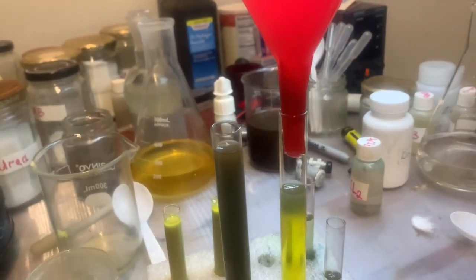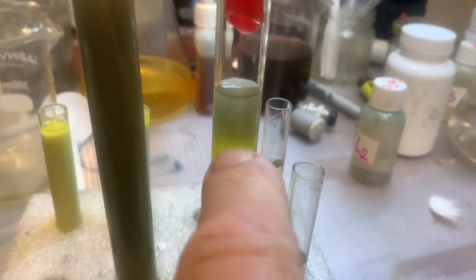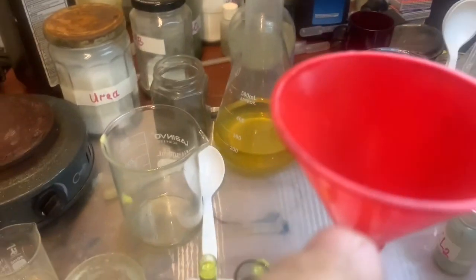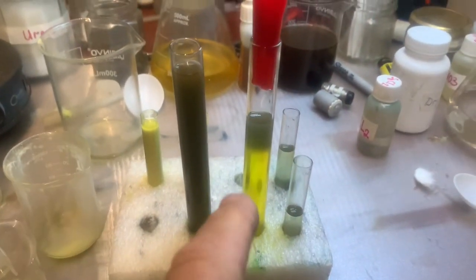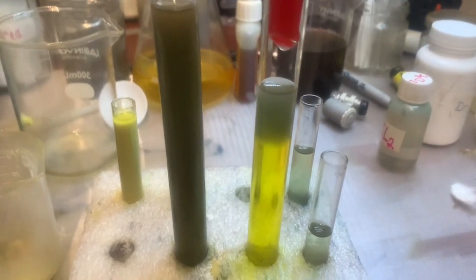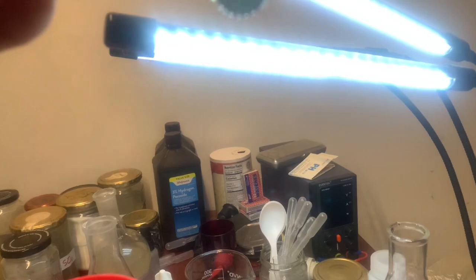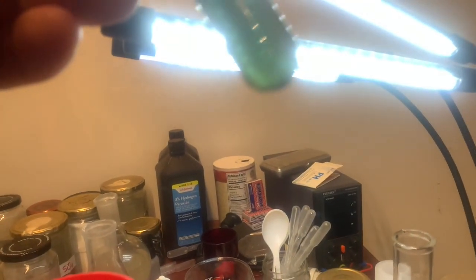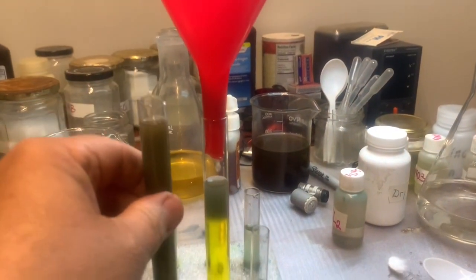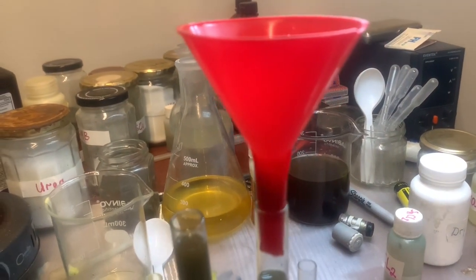Don't want to fix it, forget it. Oh, you see what's happened? The surface is already getting gold precipitating. We'll see what's happening. Okay, that way we're working. And on the bottom I didn't see anything yet, so maybe it needs a little bit of heat, put on the heat.